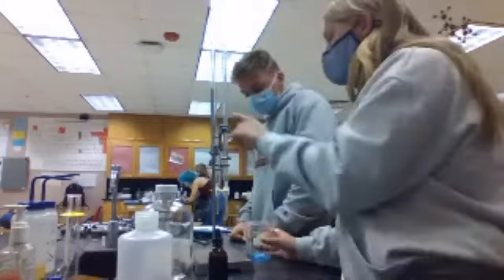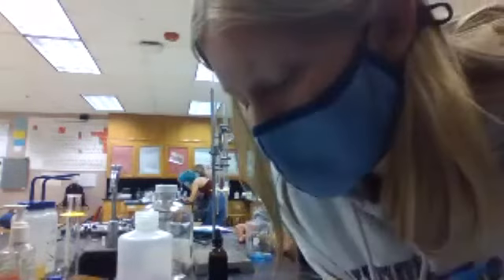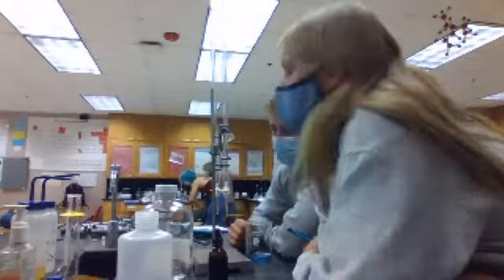Okay. Yeah, so he's gonna have to make this. So it'll have more molarity. But first we need to take the final volume of the base. So I think it's right at 38. Okay, it's right at 38. So 38.00 is the final volume of NaOH.